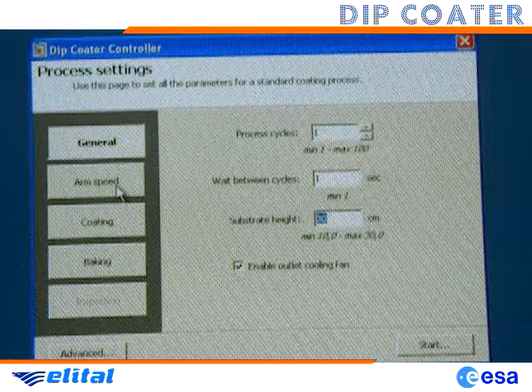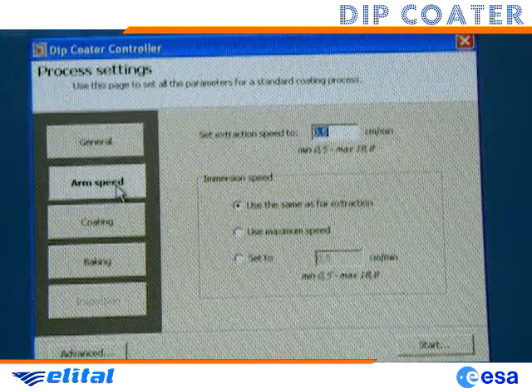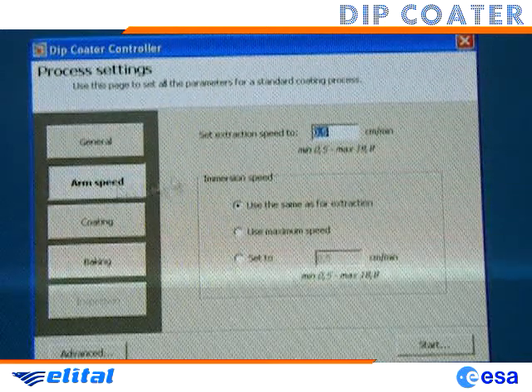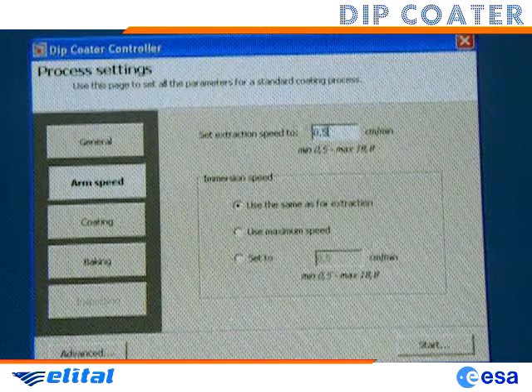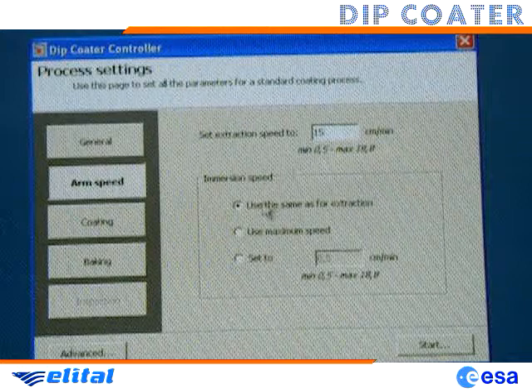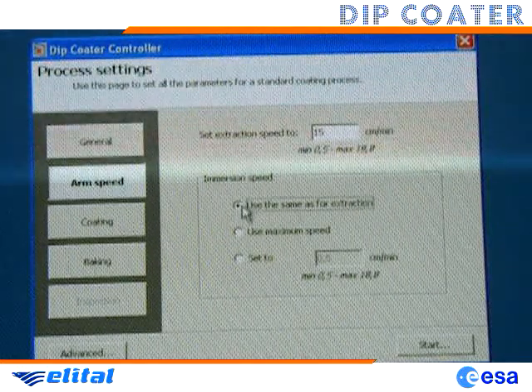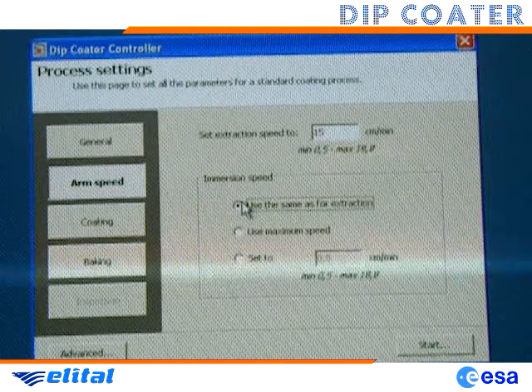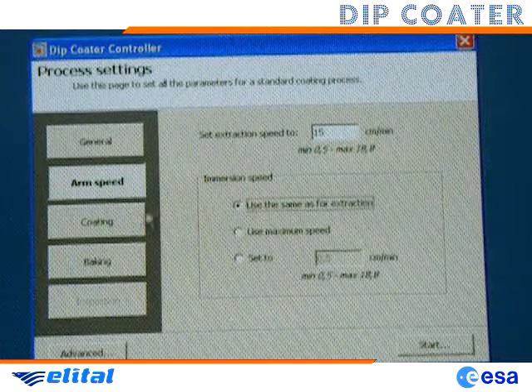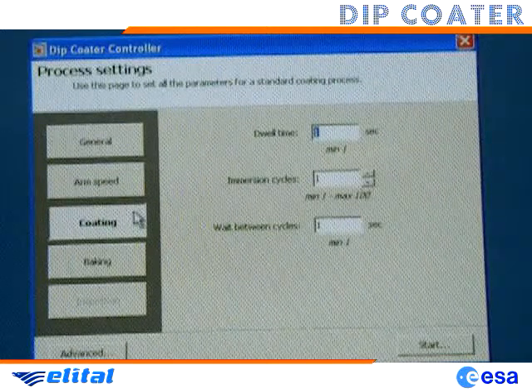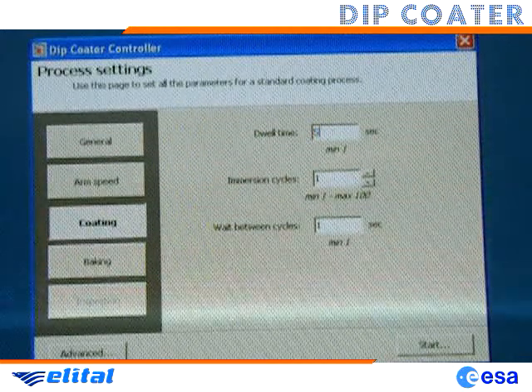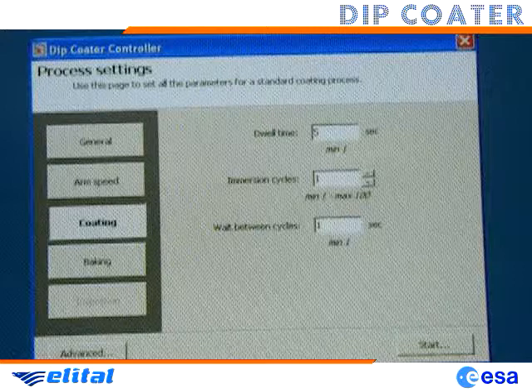Now we open the arm speed page. The Deep Coater has been designed for very low arm speeds, but for speeding up this test, we are using quite high values. We select an extraction speed of 15 cm per minute, and the same value for immersion speed by choosing the appropriate option. Now we go to the coating page, where we select a 5 seconds dwell time, which is the time the substrate spends inside the tank.